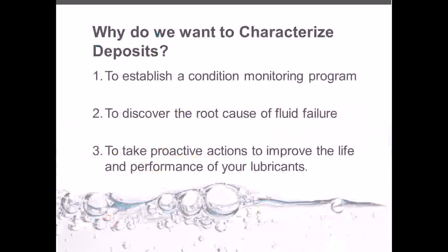The first thing is, understanding why your fluid is failing is the root of putting a condition monitoring program together. If you understand the various different failure modes that are occurring in the fluid, you can add additional tests onto your condition monitoring program that will specifically look for those modes of failure.